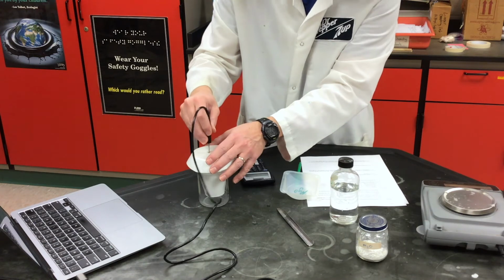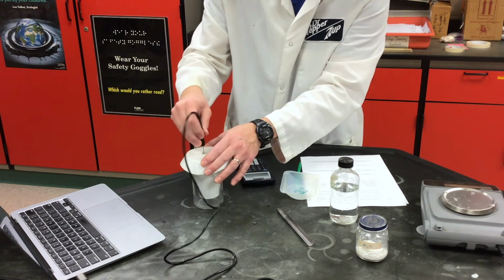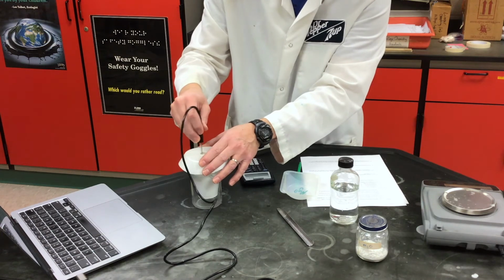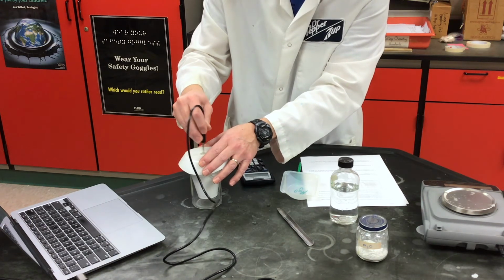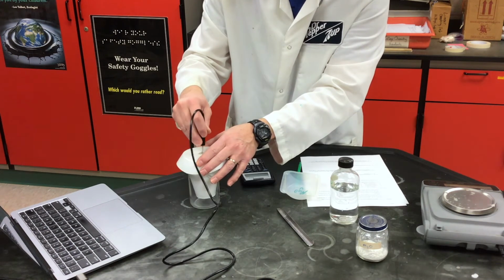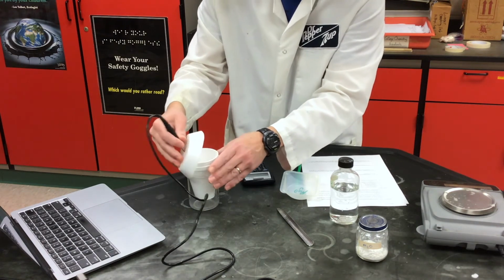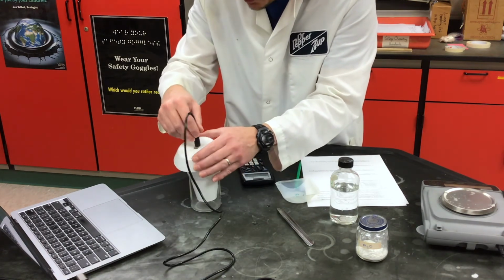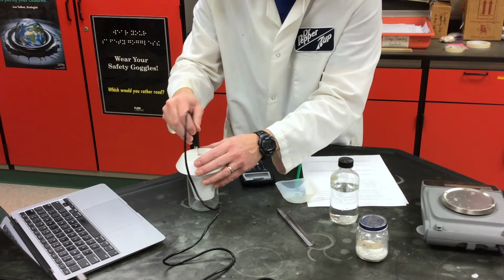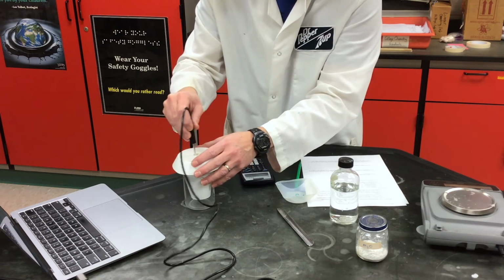22.8. And it does say on here that it could take up to 3 minutes. Hopefully it's not going to take us a full 3 minutes to get that temperature, but 22.8, 22.9. And if you were to look in here, you can see most of it's pretty well dissolved. I'm at 23.0.